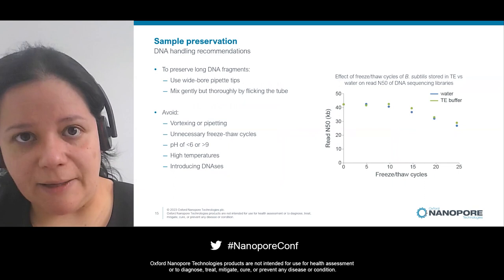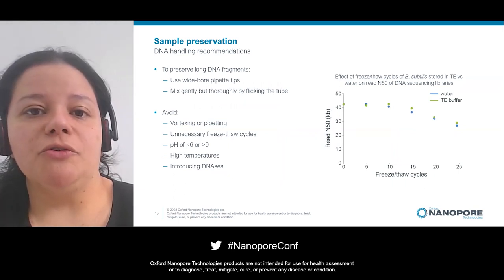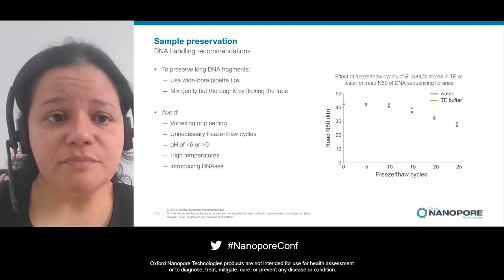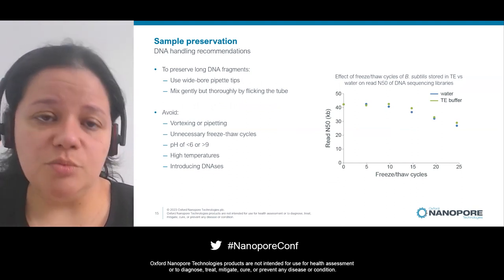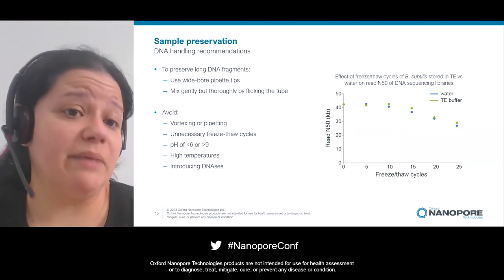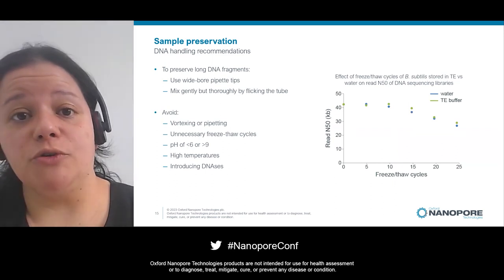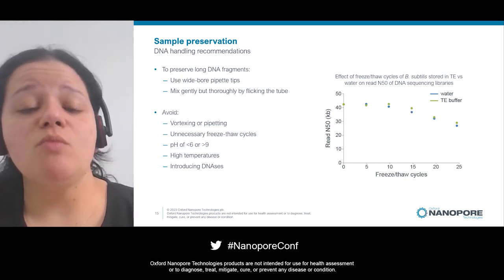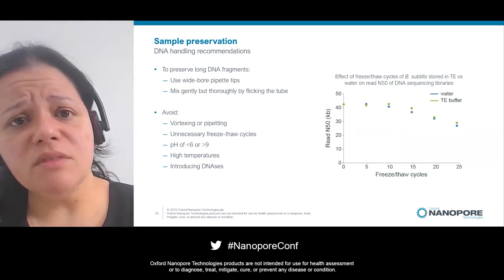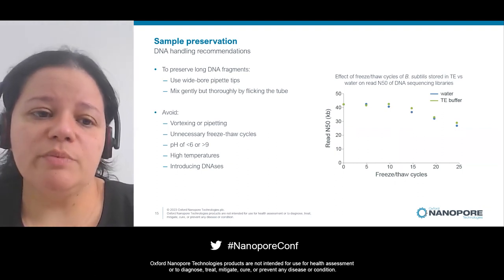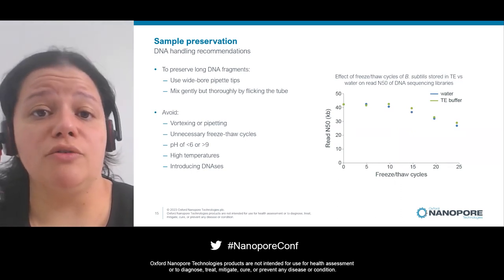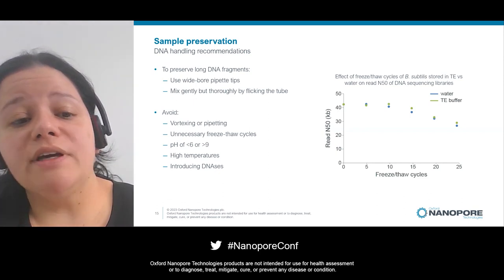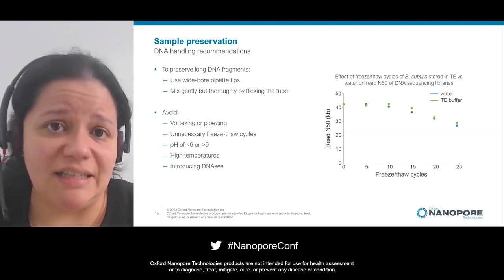When handling DNA to preserve long fragments, ensure you are not shearing your sample. Use wide-bore tips and mix gently but thoroughly by flicking the tube — do not vortex, avoid vortexing and pipette mixing. Freeze-thaw cycles also have a negative impact on read length; after 10 freeze-thaw cycles we've seen a drop in the N50. For long-term storage, keep samples in the freezer, and if you plan to use the same sample repeatedly, split it into different tubes to avoid freeze-thaw cycles.